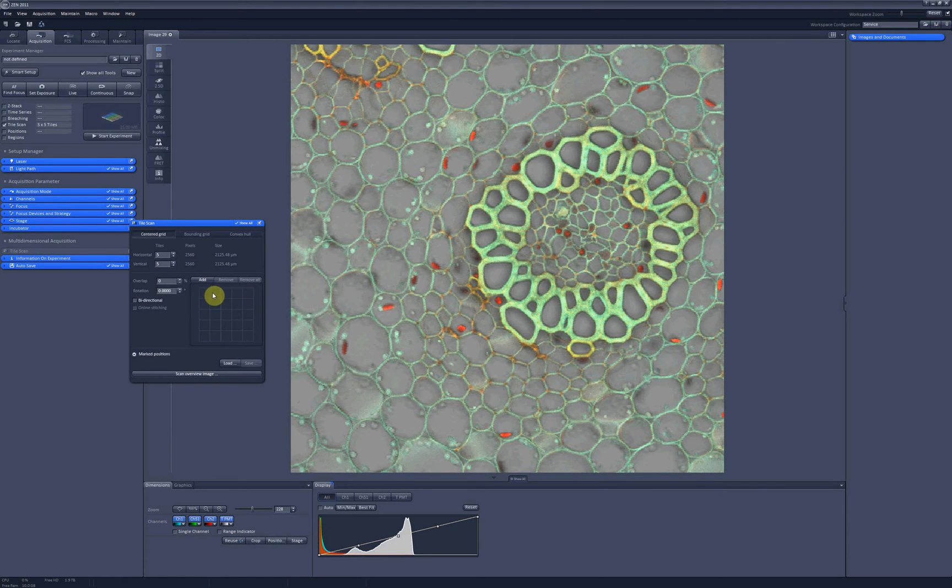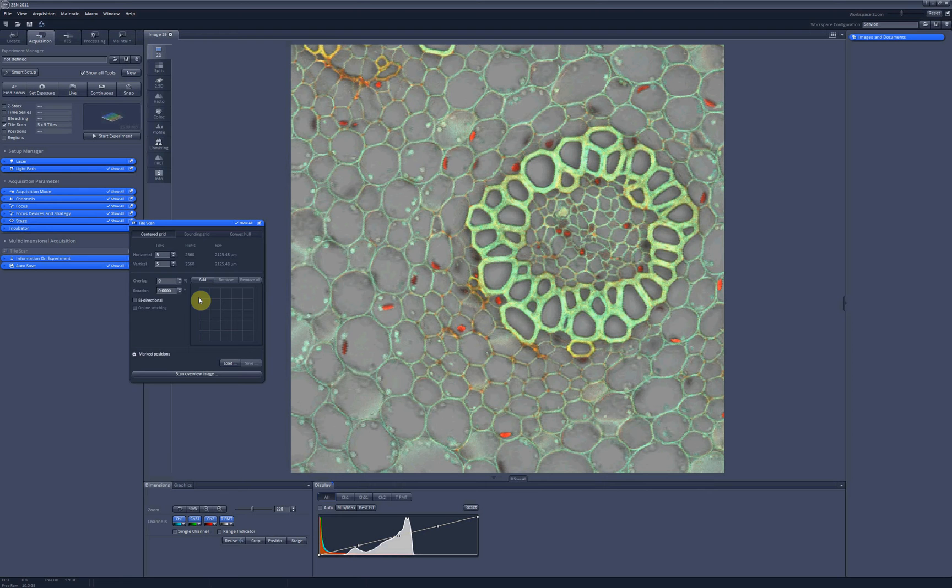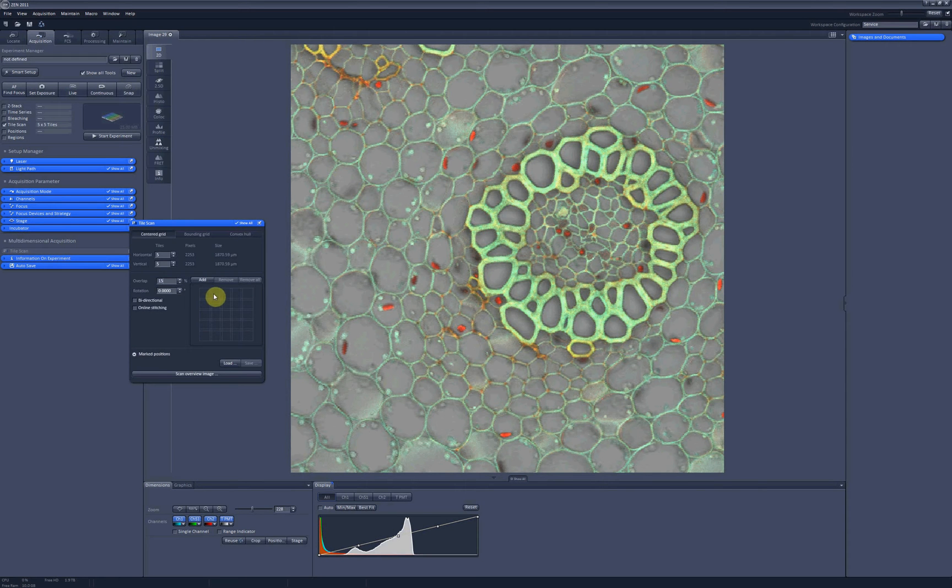The size of each tile will be the size of your acquisition area. To stitch the tiles together in a better way, it's good to have some overlap between them. To my experience, 15% gives quite nice results. Now you can see how the tiles overlap.